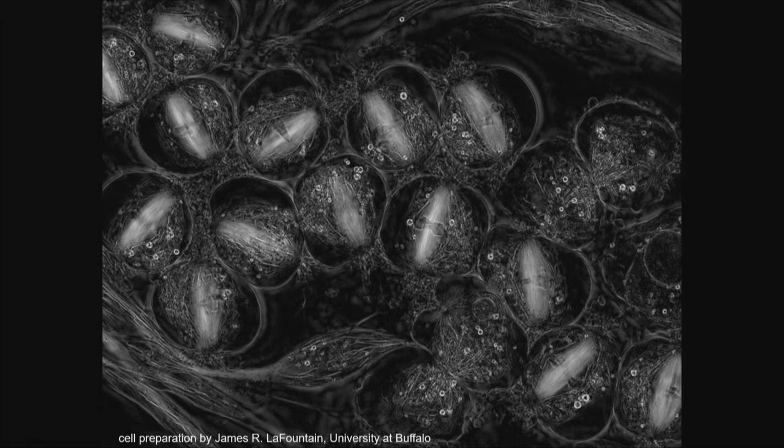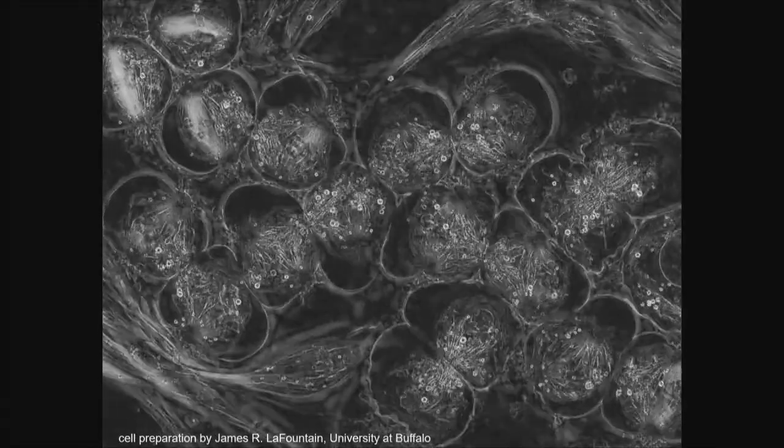So these are divisions, but they go on just like any other division. Most of it is the same mechanisms. These are microtubules that span this place, and then the chromosomes attach to these filaments, and then at some point they will move apart, and that's what we see now as we jump back in time.